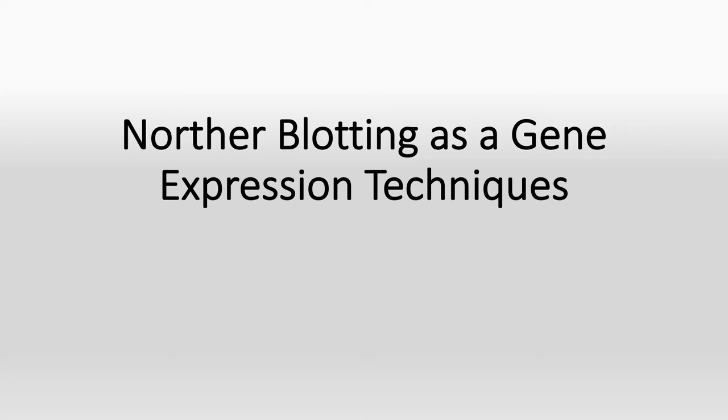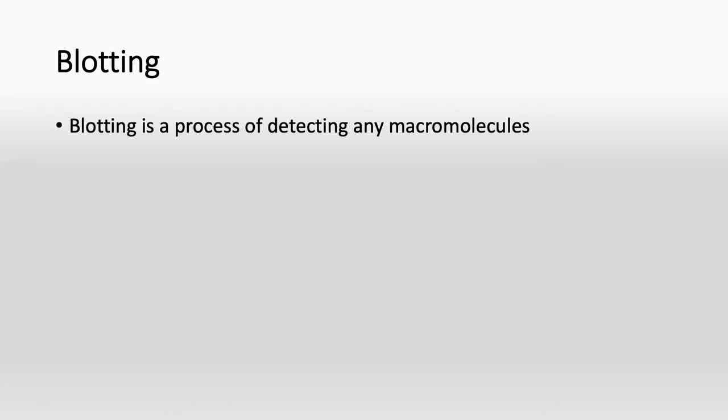So today we will be going to talk about northern blotting as a gene expression technique. Before going to talk about northern blotting, first have a look at what blotting is. Blotting is a process of detecting any macromolecules that we deal with, like DNA, RNA or proteins.